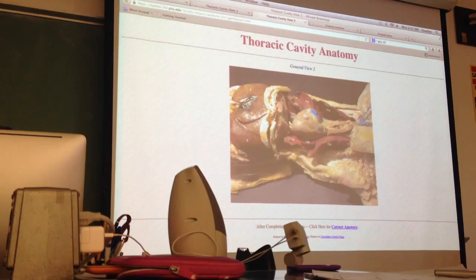For the parietal peritoneum, we'd again pin the inside of the abdominal wall. So we put a pin right here where you can see that glossy membrane covering it. And for either of these, again, we'd be asking for the layer. Okay, so if we're asking for any of the parietal or visceral membranes, we're going to be specifying this by asking you to identify the layer.